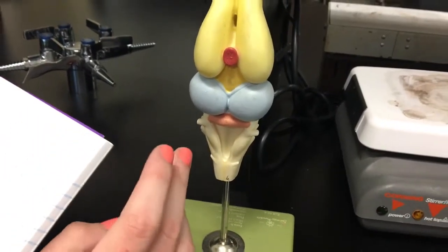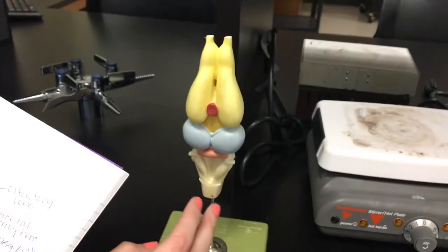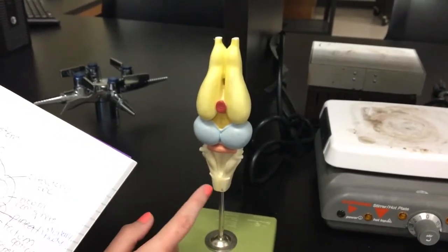Down here is the medulla, which is an extension of the spine into the skull. It is responsible for autonomic activities such as respiration, blood circulation, heart rate, and swallowing.